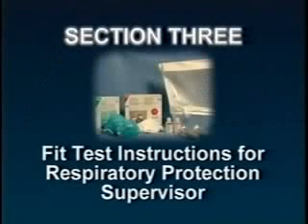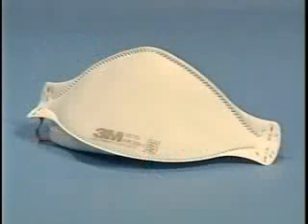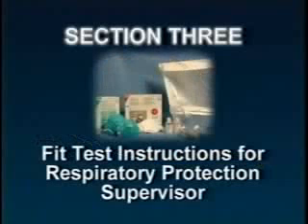This program will provide instructions on how to perform qualitative fit testing for half-face piece respirators, such as 3M Healthcare N95 particulate respirator and surgical masks, models 1860, also available as 1860S in a small size, as well as the versatile 3-panel flat-fold 1870. Please note that the instructions for the 1860 3M respirator and surgical mask being fit tested are the same for the 1870 3M N95 respirator and surgical mask.